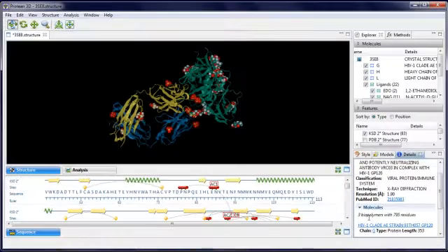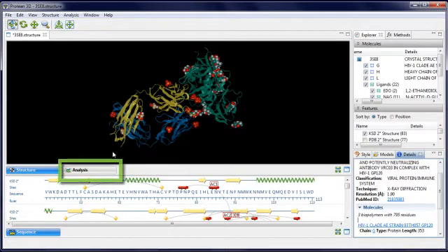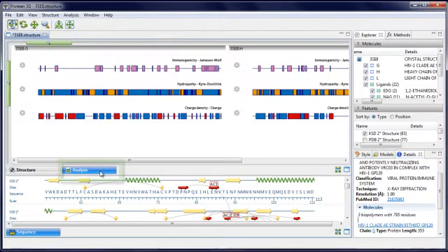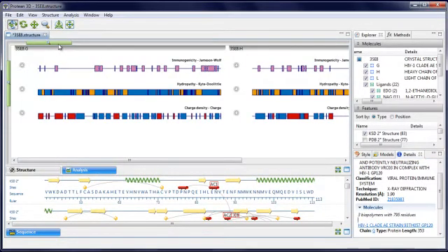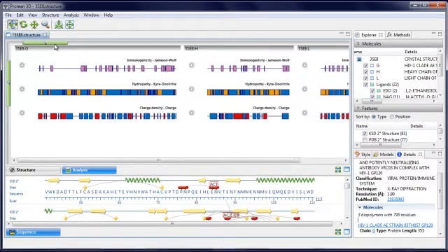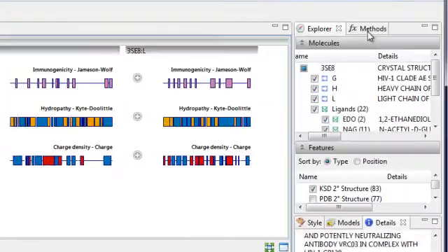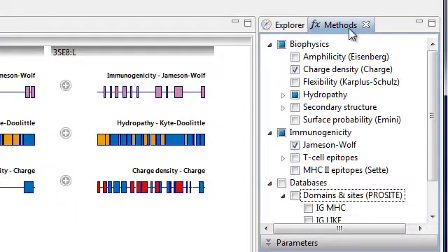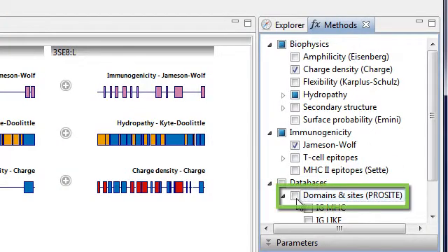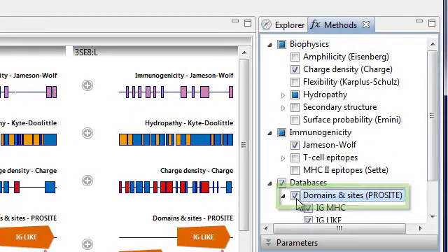To apply ProCite, first I'm going to open the analysis view, and I'm going to zoom out a bit so that I can see the analysis methods for all chains at once. And then I'm going to go to the methods panel and check domains and sites ProCite.